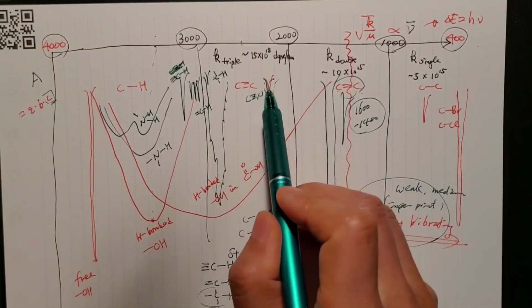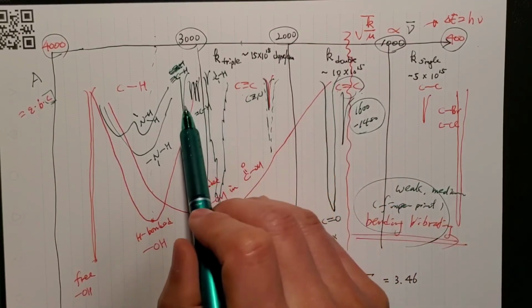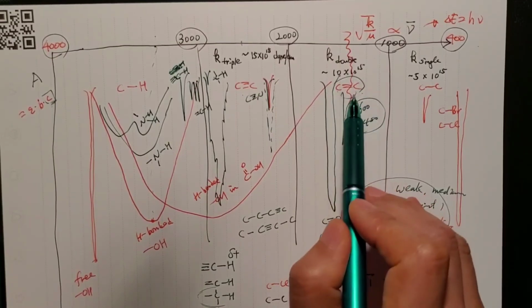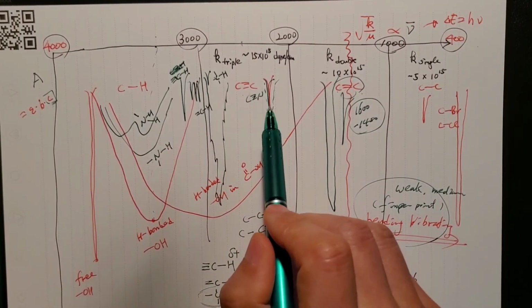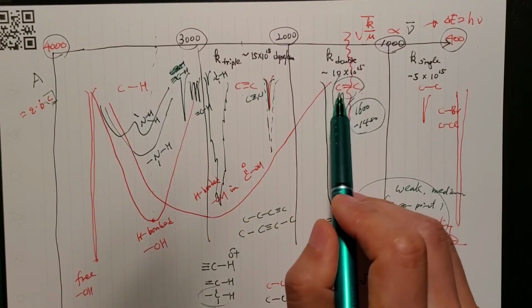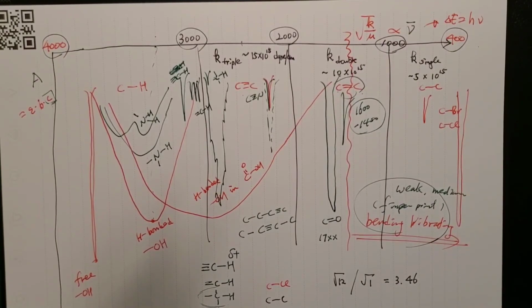So without this peak, if you saw something here and you see something there, then connecting them, you can say I have a double bond, not a triple bond. If you see something there and you have one signal here, then it cannot be a double-bonded carbon hydrogen. So you see how the logical thinking starts to kick in.